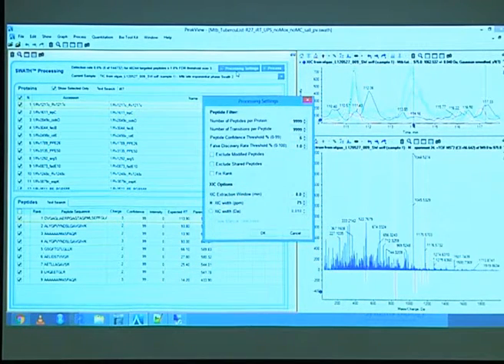And down here you have more mass spec related choices. One is the retention time window. We'll cover that later too. And a mass error for the fragment ions. So what's the mass error that you tolerate? Both of these are the entire window. So a retention time window of 8 means it is the center of where you would expect it to be, plus minus 4 minutes.